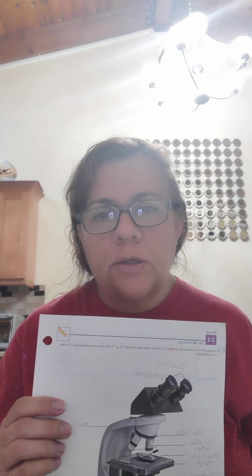see, because we're talking about microbes and they're so tiny that the naked eye cannot see them, so of course we need it bigger. But then comes the second one, which is resolution, because you can make things bigger, but if they're fuzzy, you really cannot see well.